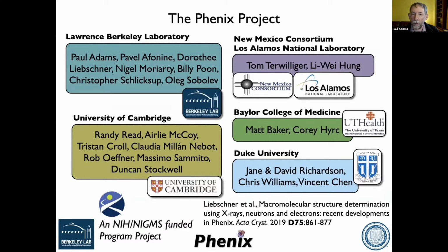When it comes to things like ligands and waters, you're not going to see those in the 7 angstrom map. And even though you might believe that they're there based on the biochemistry and maybe this other structure, it's a little bit unreasonable to put those into your low resolution map, because you've got no evidence they're there. You've got evidence the protein is there, I imagine, because you can see the envelope for the protein. But anything else, those details, you can't really claim are there.